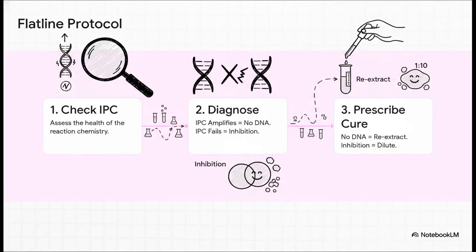So what do you do? Step 1, check the IPC, always. If the IPC worked just fine, that tells you the reaction chemistry was perfect. The diagnosis? It's a biological failure. There was just no DNA in your sample to begin with. The cure is to go back to the original evidence and re-extract it.